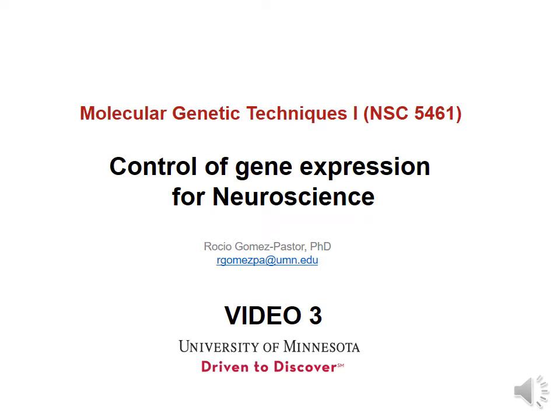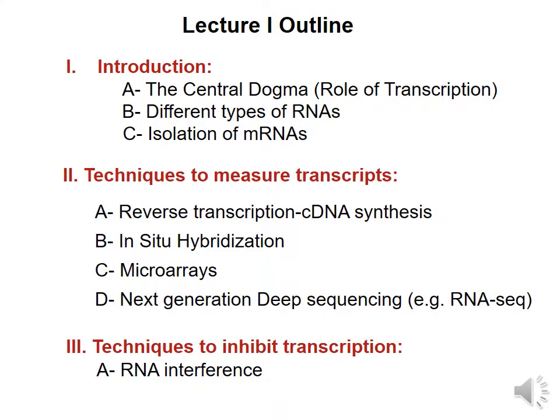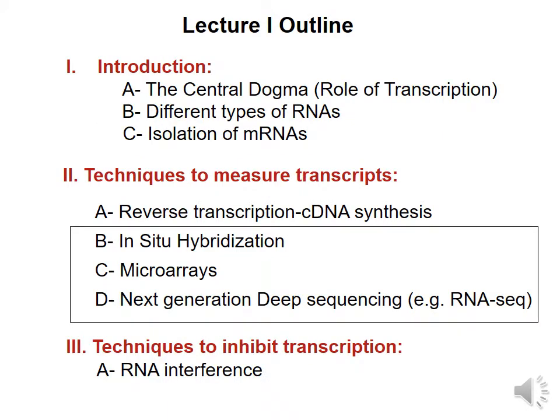In this video 3 for Control of Gene Expression for Neuroscience lecture, we will keep talking about techniques to measure transcription. Particularly, we will talk about in situ hybridization, microarrays, and next generation deep sequencing or RNA-seq.